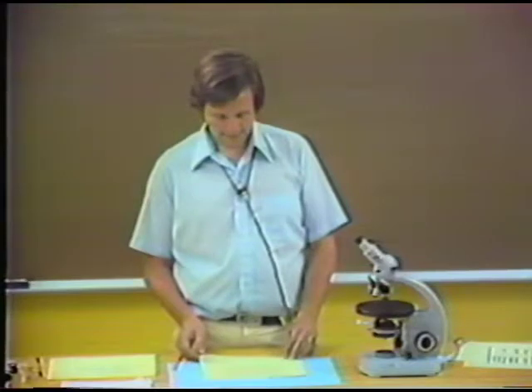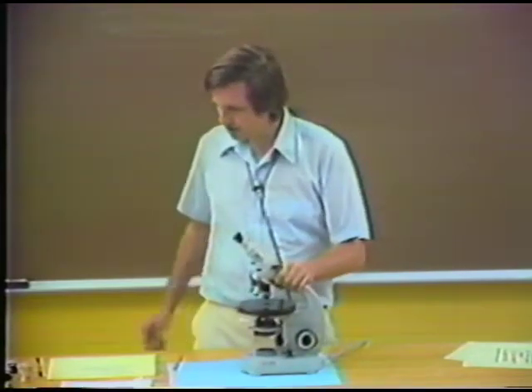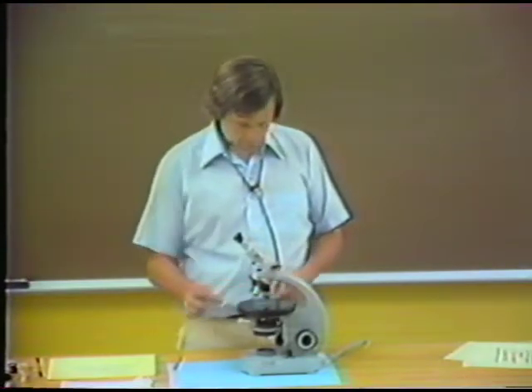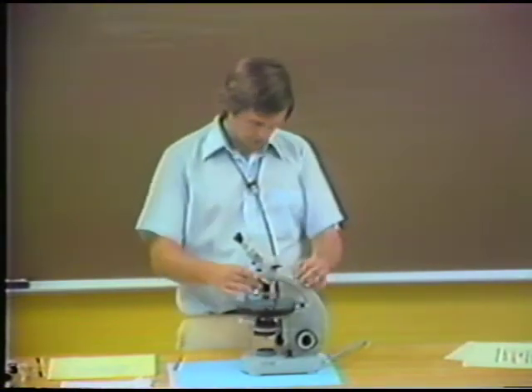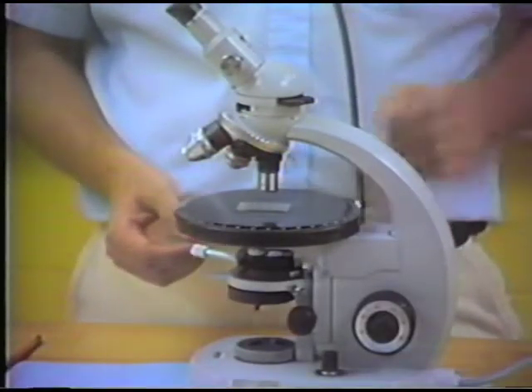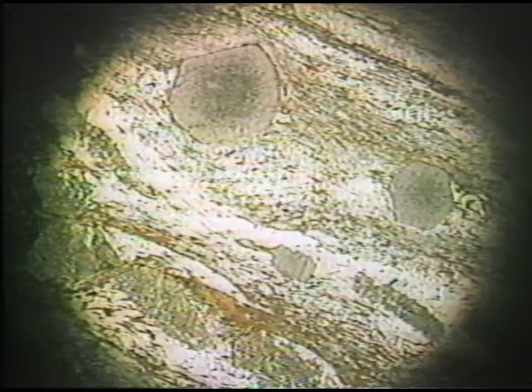Well, let's make a test like this within a thin section that includes some isotropic minerals to demonstrate its utility. So I've got a thin section prepared here of a garnet-bearing schist. Of course, garnet is a member of the isometric crystal class, and it's a good isotropic mineral. And so if we look at this specimen in the plane polarized light, which we're doing now, you can see the definition of particular mineral grains. Now, most of the minerals in this rock, as they are in nearly all rocks, are anisotropic.